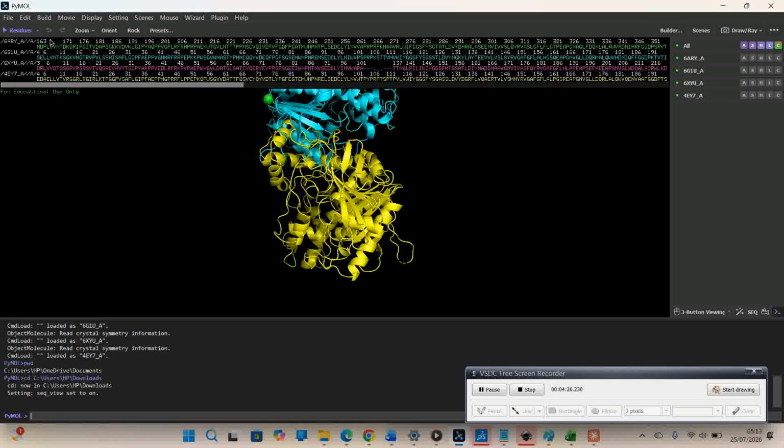So to make it easy, let's use the human enzyme 4EY7 as our reference enzyme, and then let's superimpose and first confirm the RMSD, just to check structural compatibility. So I'll just say align in this command phase. Align 4EY7_A. After cleaning, I saved it here as A just to indicate that. Align 4EY7. Let's start with 6ARY. Enter.